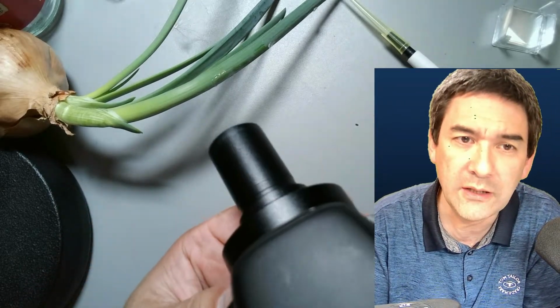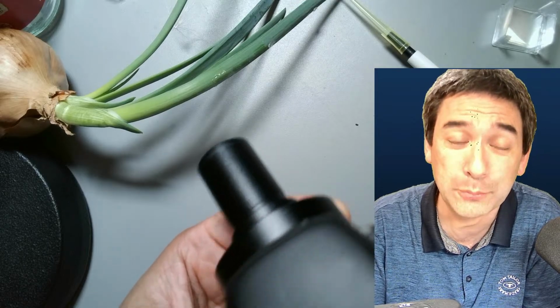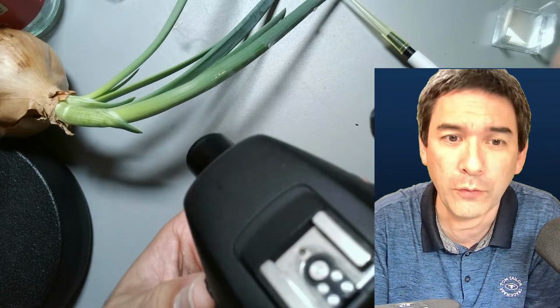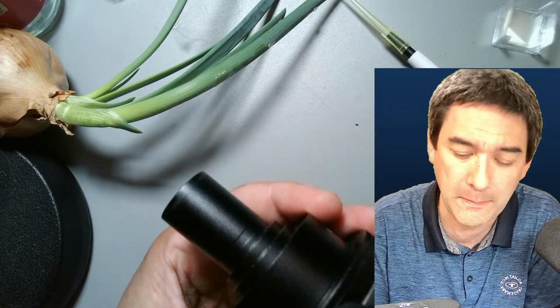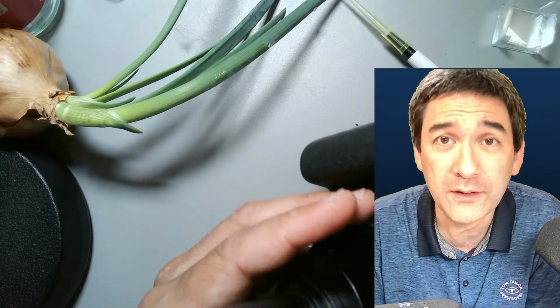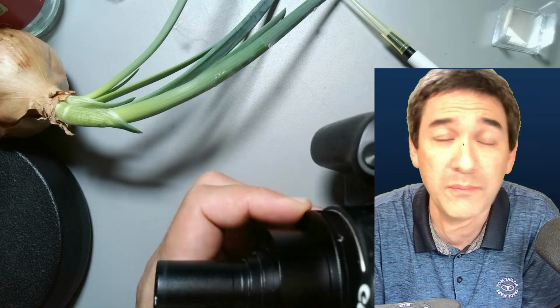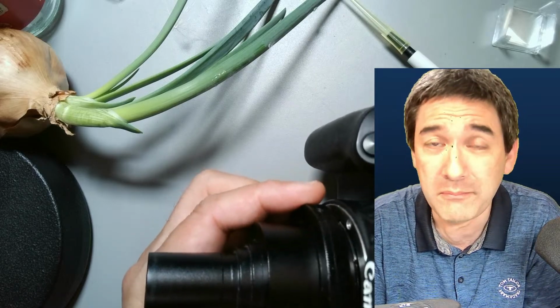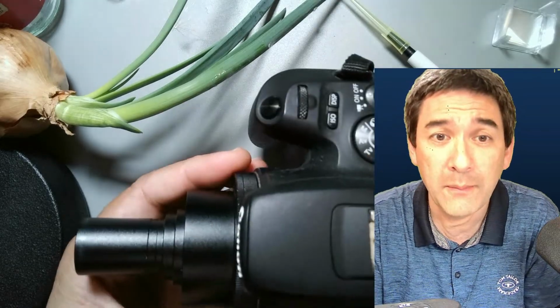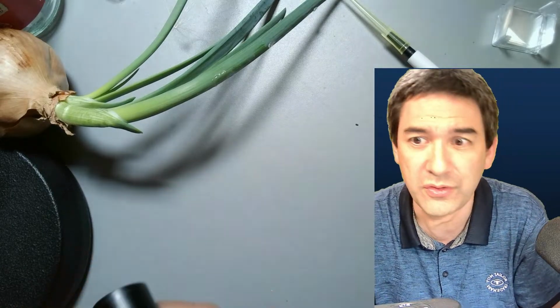You can theoretically also put it into the microscope instead of one of the eyepieces, but the problem is it's so heavy that you have to be careful that the microscope doesn't tip over, or you have to give it some additional support. That is only one way. There are different things as well. For example, you can use HDMI cameras and so on. So there are different ways to connect a camera. But because you were just asking about my setup, I just wanted to show that to you. Okay, yeah.